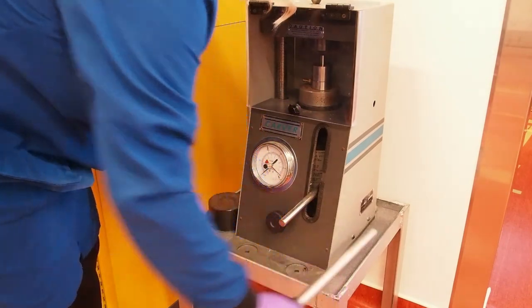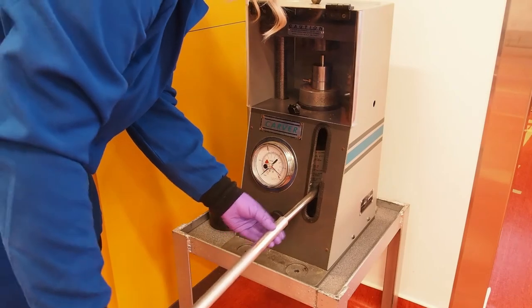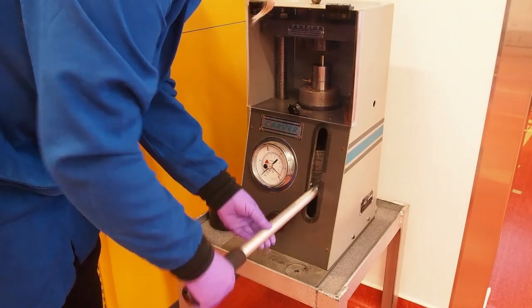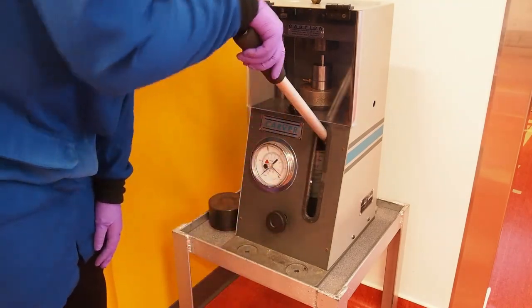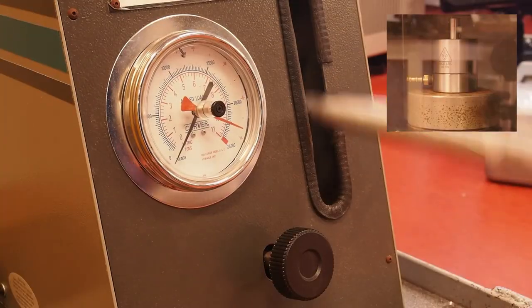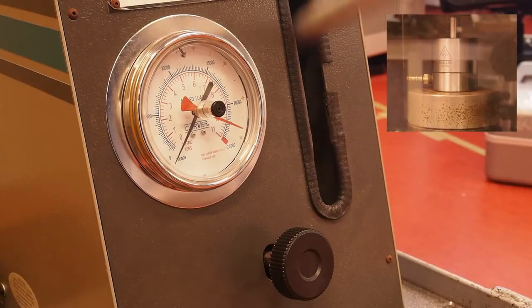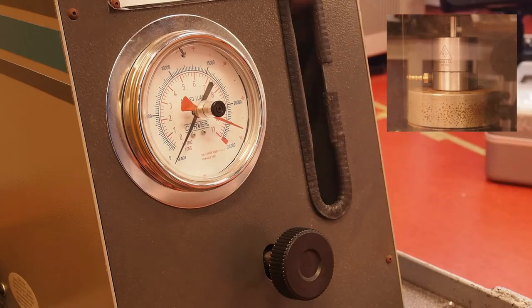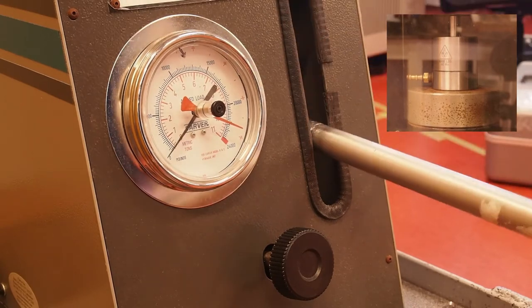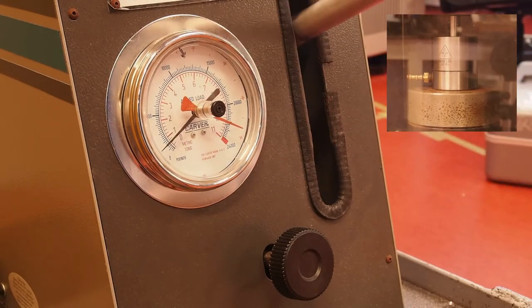Turn the pressure building knob clockwise to begin building pressure. Pick up the handle and place it onto the press lever. Pump the handle to begin building pressure. Continue to pump the handle until the pressure gauge reads 5 metric tons.